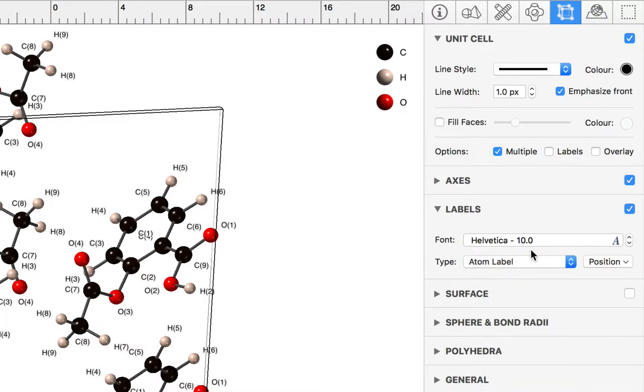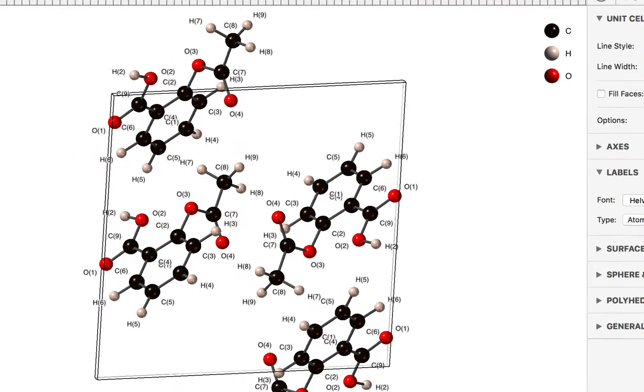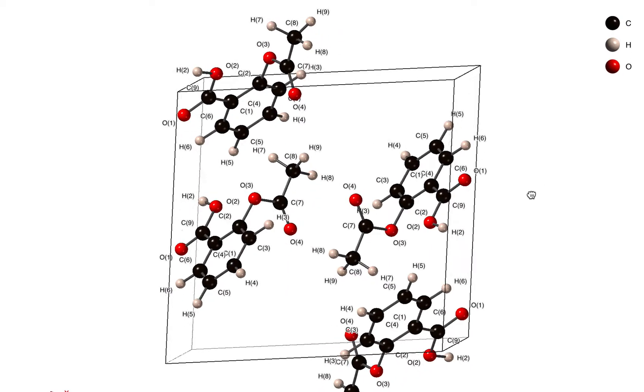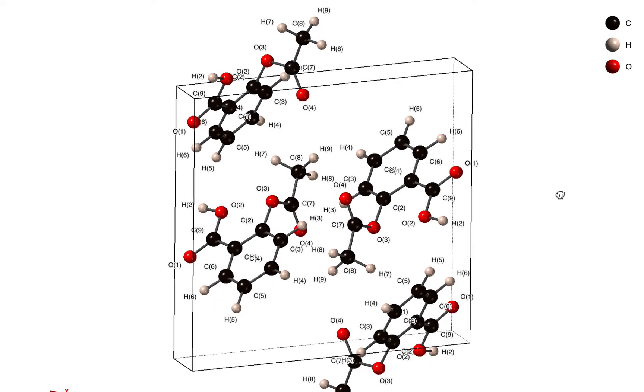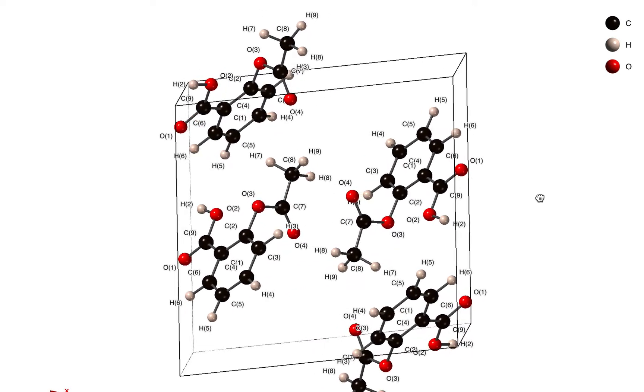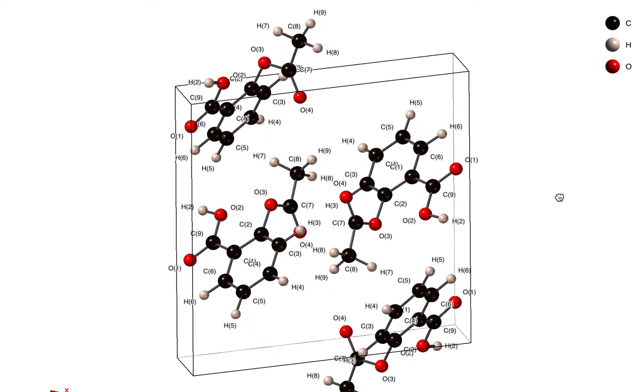For the moment let's have the atom labels, and CrystalMaker is automatically set to auto position those labels to try and minimize overlaps between labels and bonds.